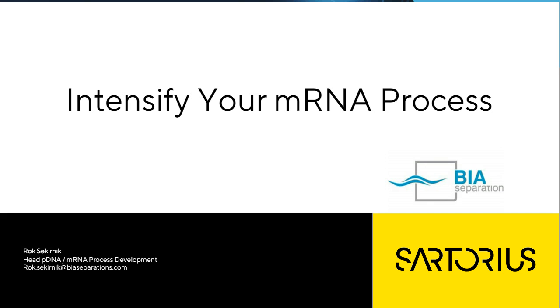Fantastic. Thank you for the clarification there. Next question, does oligo-DT work with self-amplifying mRNA?